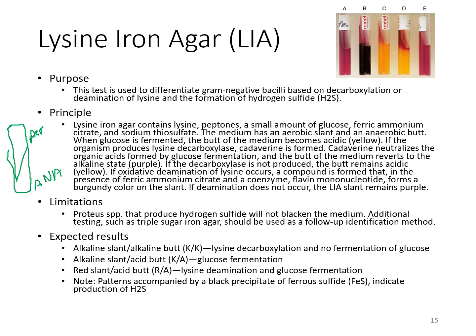So when you introduce the organism, you would stab the slant, and then you would also streak the slant. So you would stab down into the agar to the bottom and streak the slant. And so you're looking to see how this organism will act in the presence of the lysine with and without oxygen.